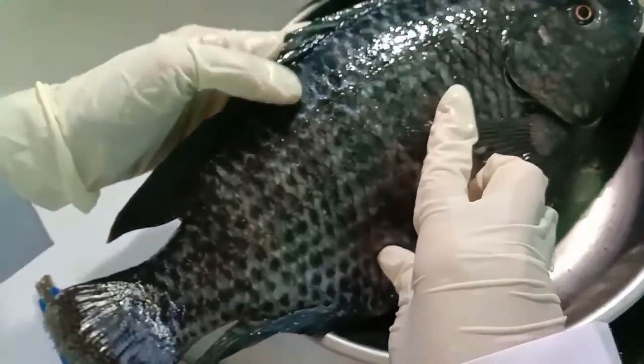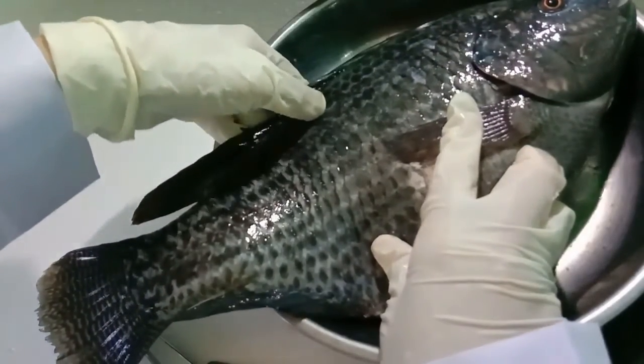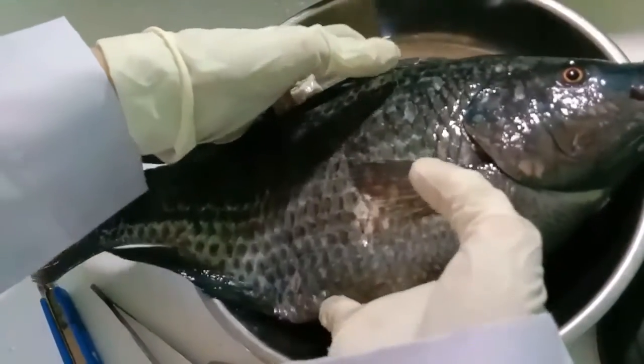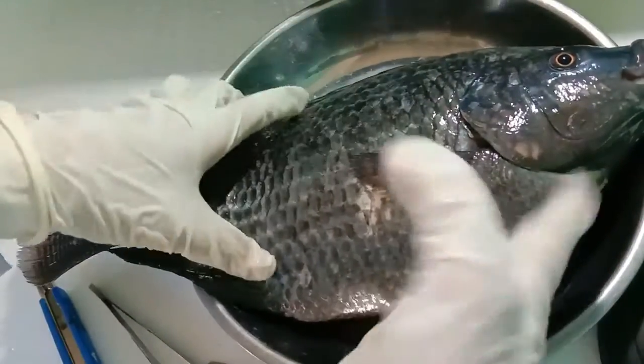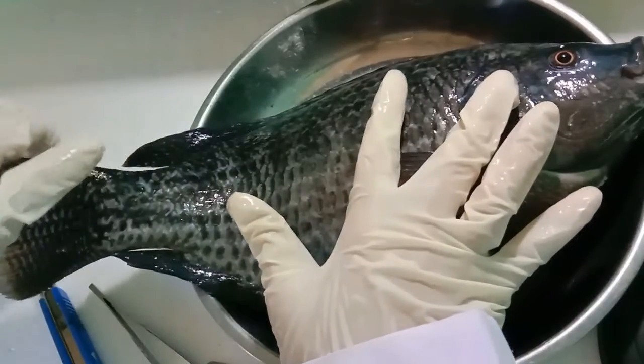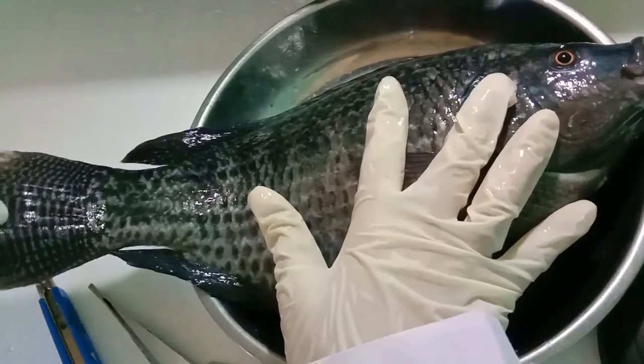It is a groove along each side of the body with many tiny openings to the outside that are sensitive to vibration in the water. It is made of sensory cells to detect vibration that is caused by waves and other movement of the water, including movement of the predator.